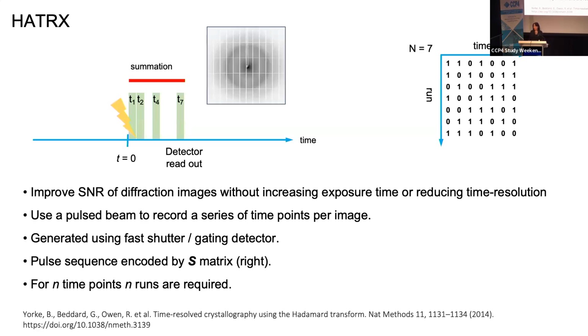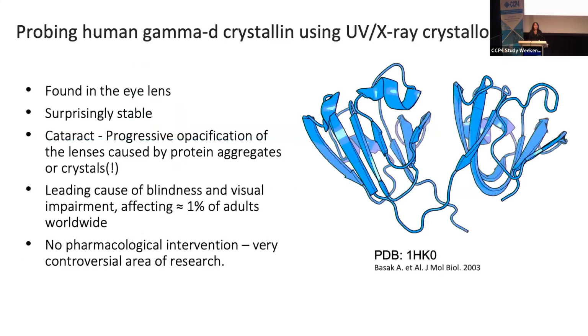It's important to note that all proteins really are photosensitive, but is that photosensitivity really related to biology? That's why I was looking for a new protein that was well characterized and quite simple, that I could then look at and develop new methods. And so my boss at the time, Arwen, said, have you heard of crystallins? And I was sold at the word crystallin, as a crystallographer. It seemed quite an attractive protein to look at. This is really quite interesting.